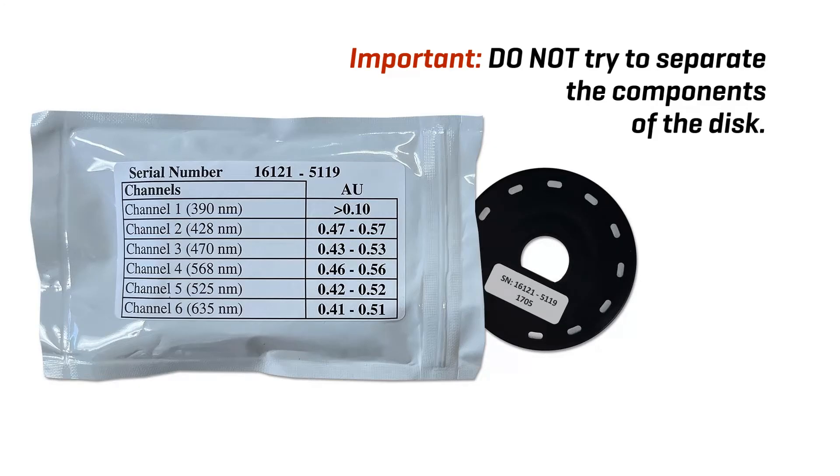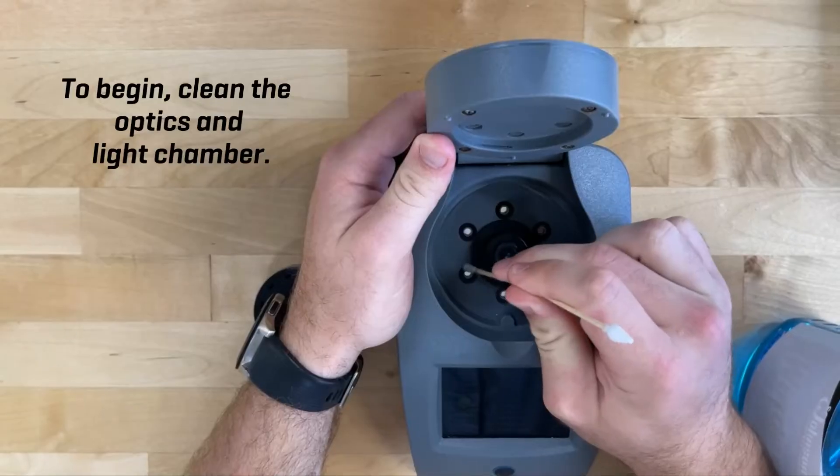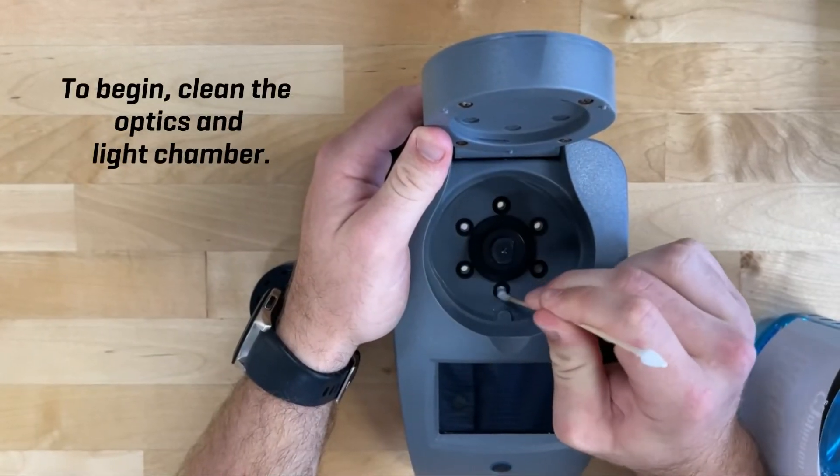Do not try to separate the components of the disk. To begin, clean the optics and light chamber.